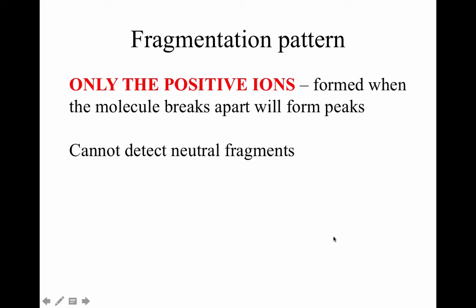Important to note, only the positive ions are detected by a mass spec because those are what's going to be deflected to the detector. It does not detect neutral fragments.